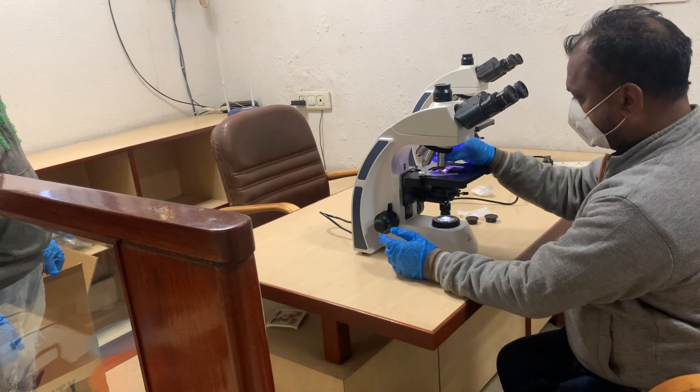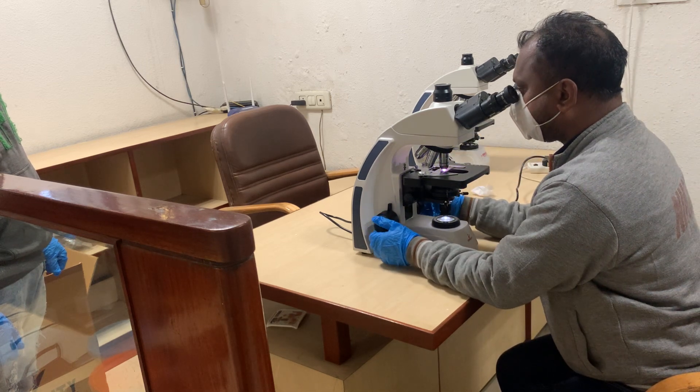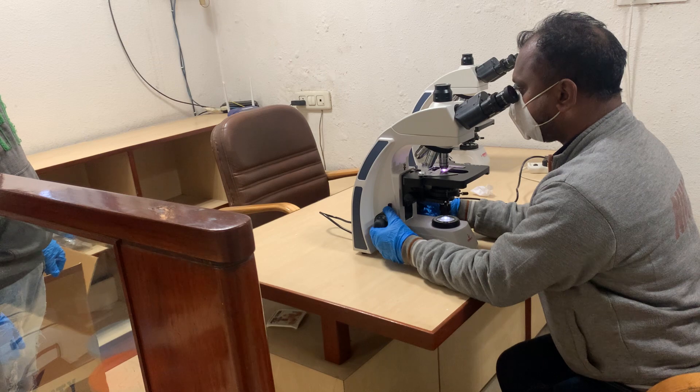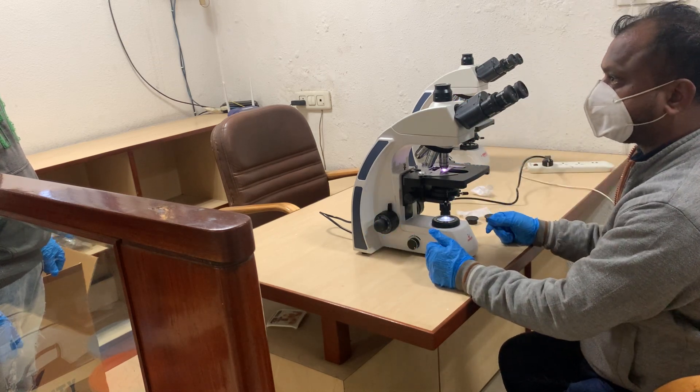If you need to use the 100x objective, you need to use oil immersion — just put one drop of oil. All the objectives are parafocal and paracentered.